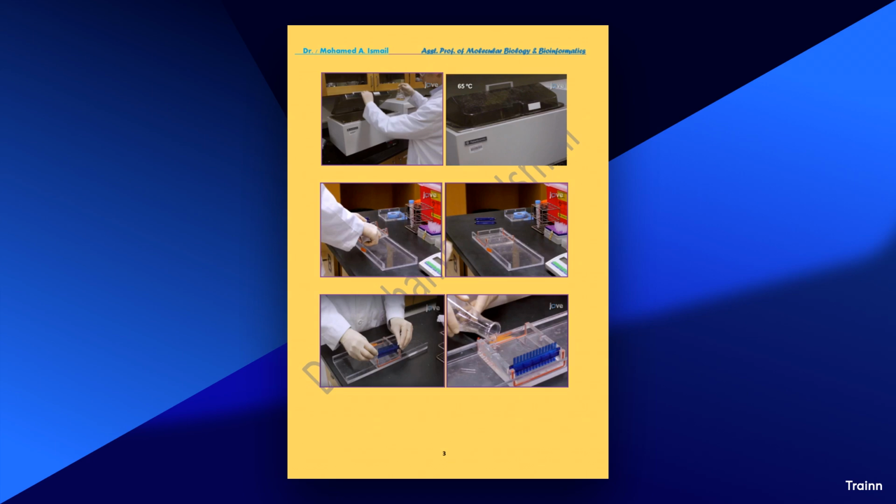Detailed overview of agarose gel electrophoresis of PCR products. 1. Gel preparation. Agarose concentration. The concentration of agarose in the gel determines the pore size, which affects the resolution of DNA separation. Common concentrations include 0.7%, suitable for separating larger fragments, greater than 1 kb.